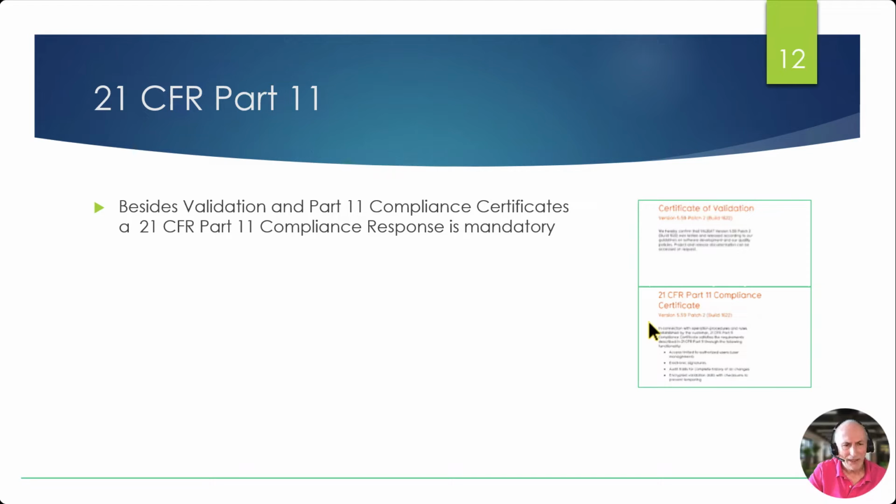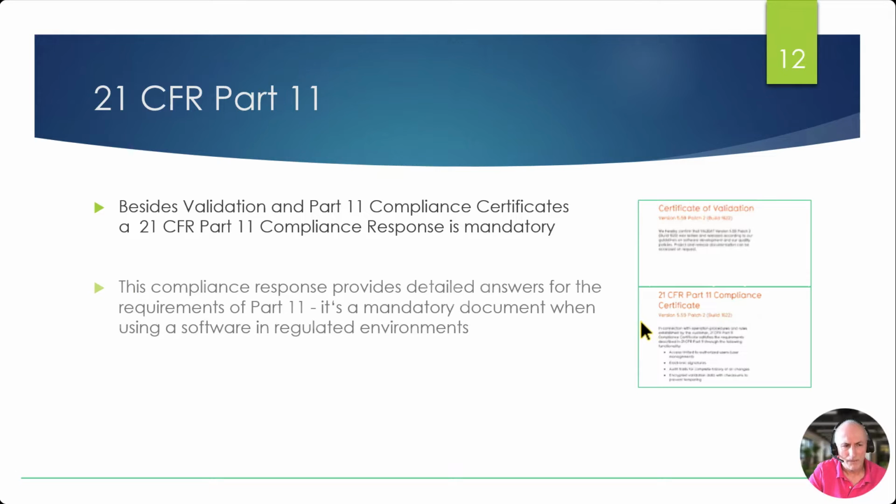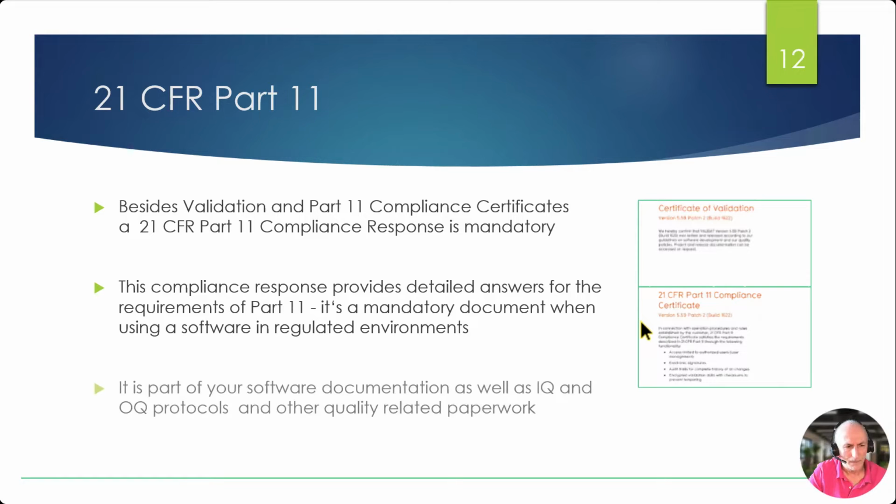Besides validation and Part 11 compliance certificates, a 21 CFR Part 11 compliance response is mandatory. This compliance response provides detailed answers for the requirements of Part 11. It's a mandatory document when using a software in regulated environments. It is part of your software documentation, as well as IQ and OQ protocols and other quality-related paperwork.